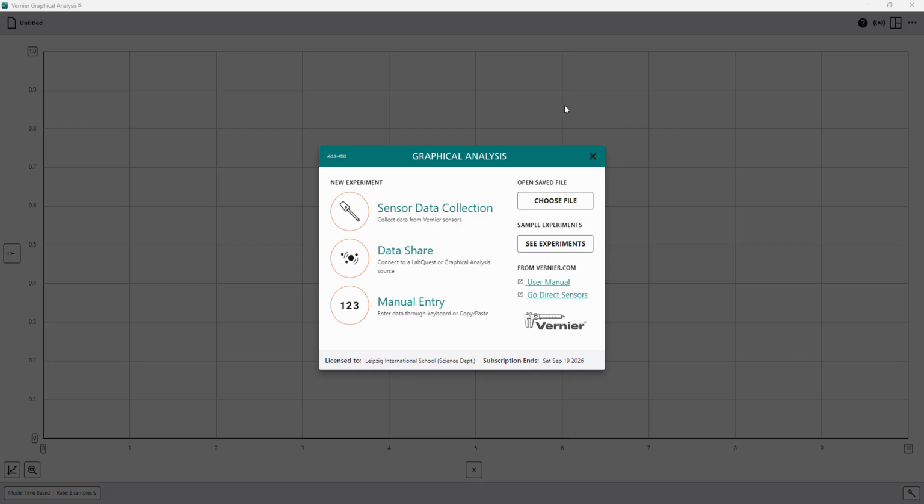Now, the first thing I want you to do is, after you have successfully downloaded the app for your operating system, let that be Mac, Windows, Linux. I think there is no available option for Linux, okay, but if you're working on Linux, please switch your operating system for this purpose to Windows, and then you will be able to activate the full license by clicking on the link that I have on your Google Classroom.